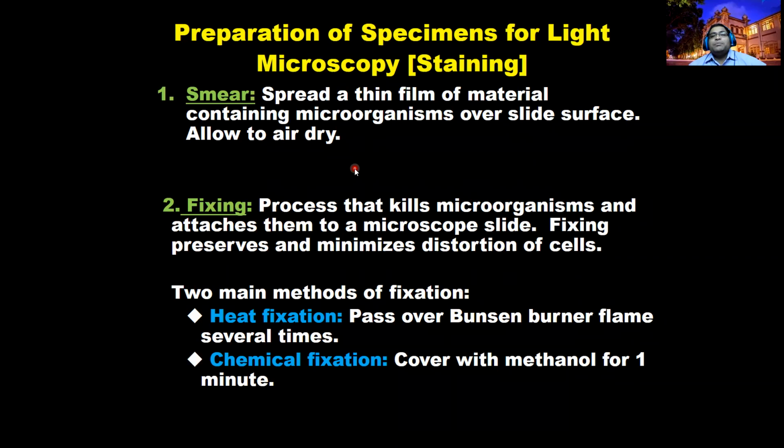And another thing under the light microscope: we call it staining. We are using another type of microscopic technique, which we call staining. The microscopic techniques start from pith cutting. You can use the pith to make a shallow cut. It's one kind of technique. The second kind of technique is using wet mount slides with a drop of water and a cover slip. You are not doing any staining in those two. The third technique is staining.